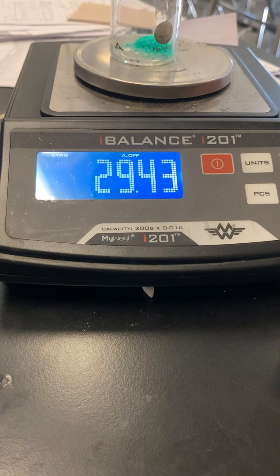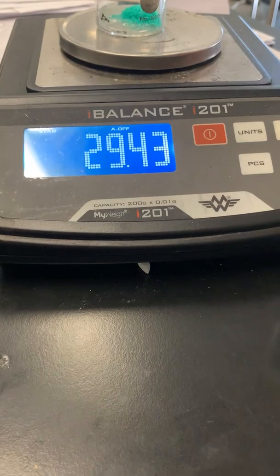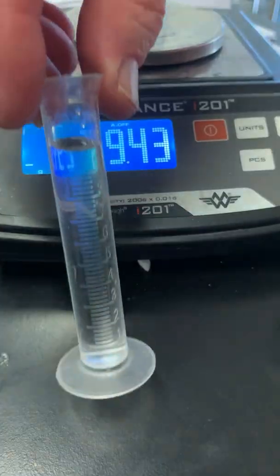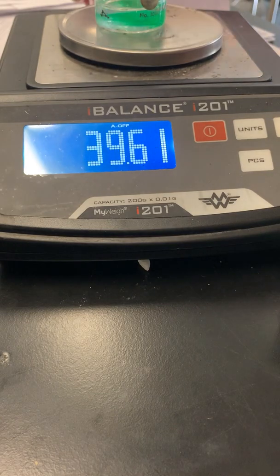All right, next, using a 10 milliliter beaker, I need to add some water, preferably distilled water. But honestly, all the distilled water is gone. So I measure 10 milliliters in my graduated cylinder and add it to the solution.